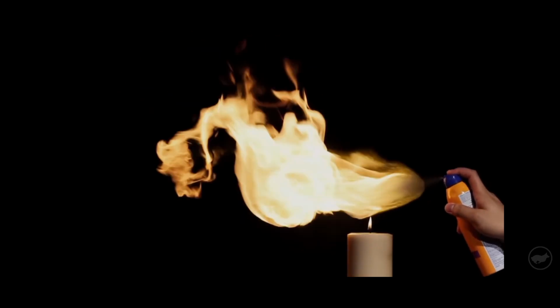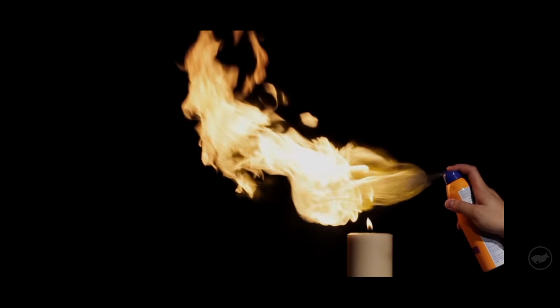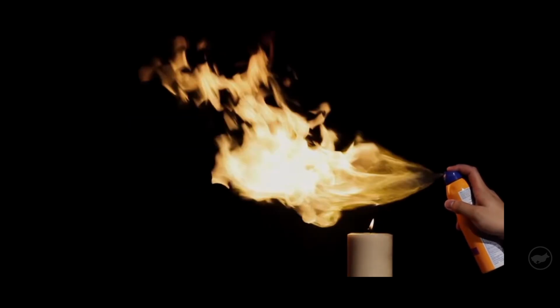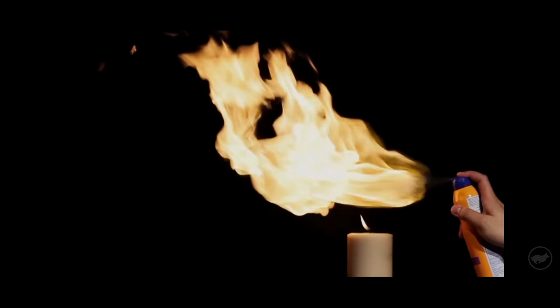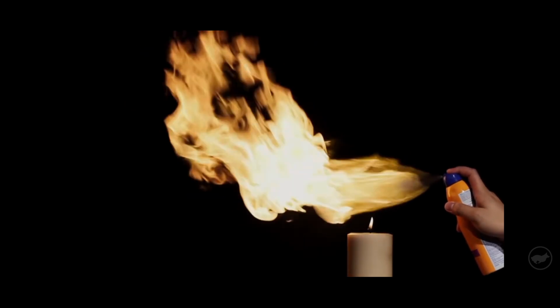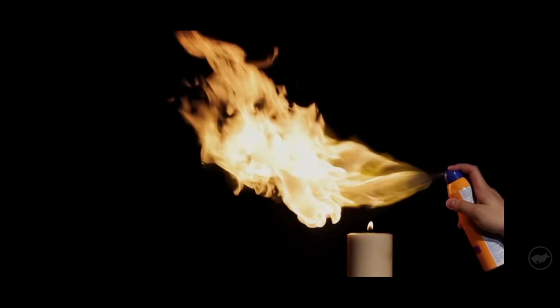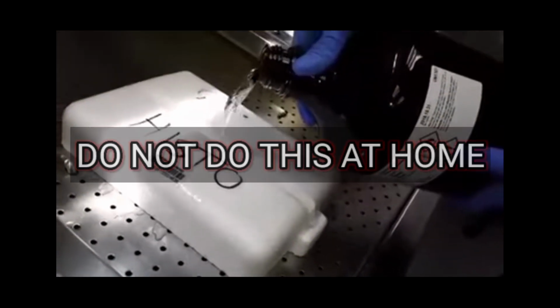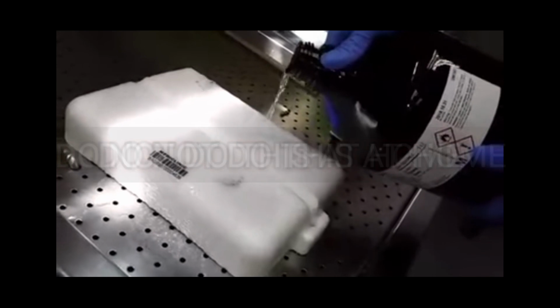Most clearing agents are flammable liquids that warrant considerable caution in their use, and the histotechnologist should be aware of the large quantities used in routine processing. This is done so that the safest method of use and storage can be adopted.